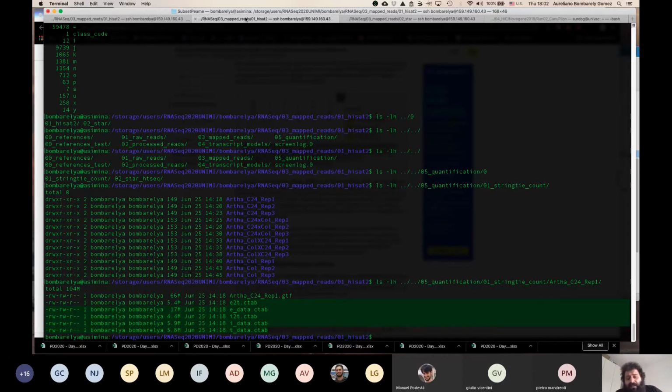But for expression analysis, at some point you need to decide if you want to work with single reads or with pairs, but you cannot work with both at the same time. So it is not useful to keep 4 files. I can just throw away the 2 unpaired files. Yes. Okay, thanks. I understand.